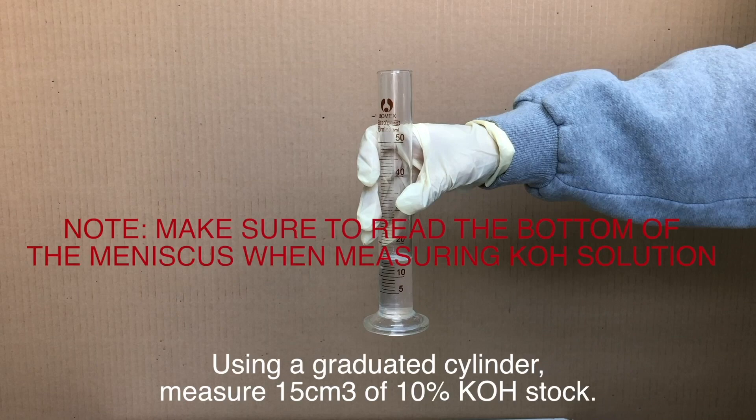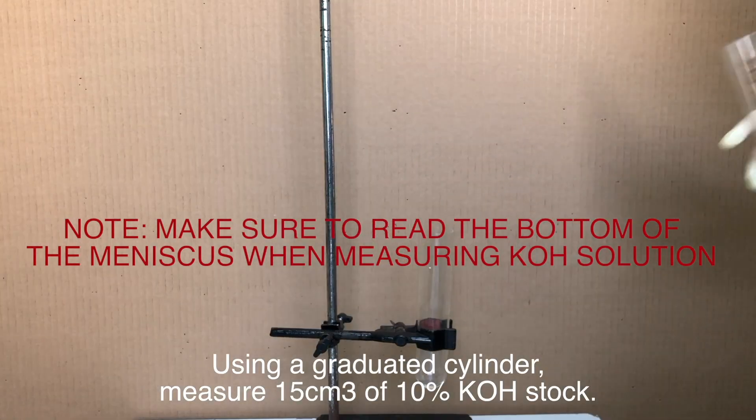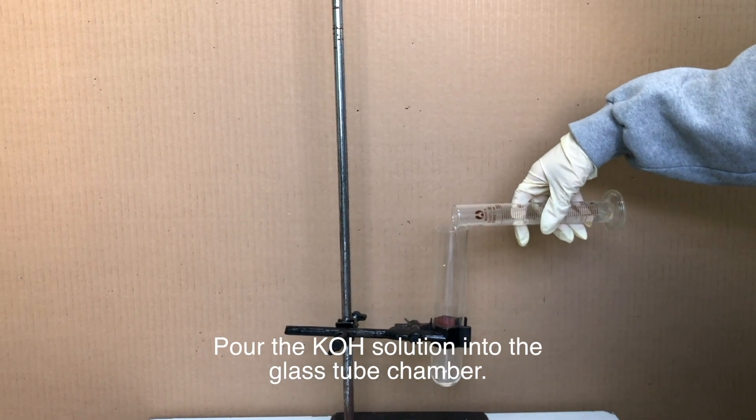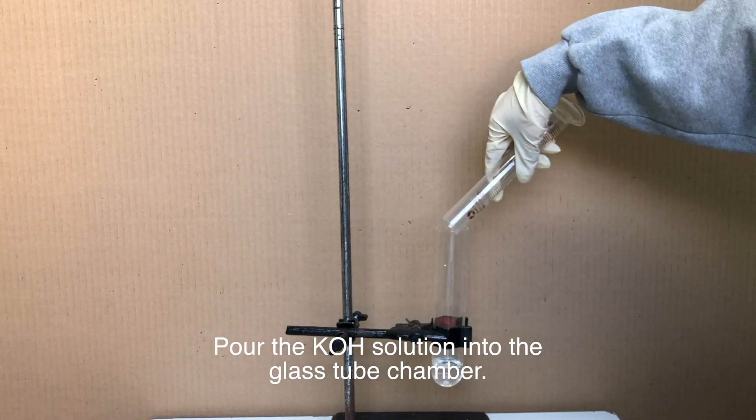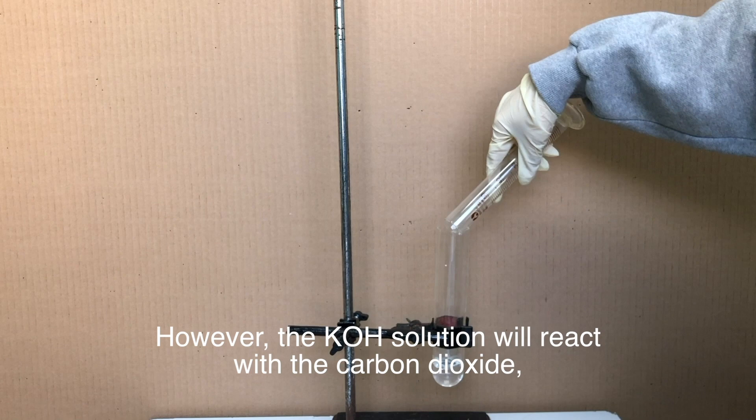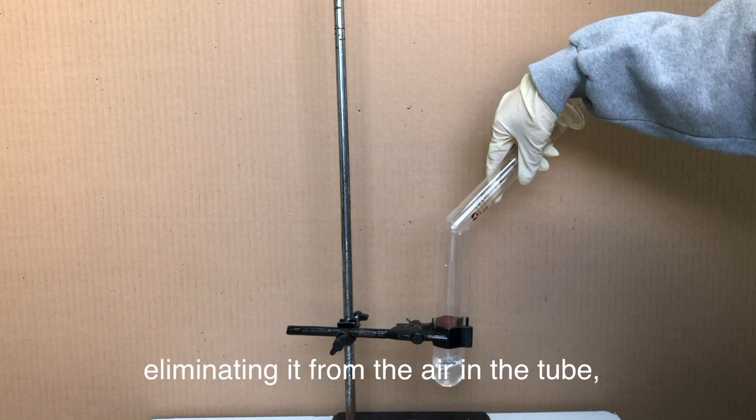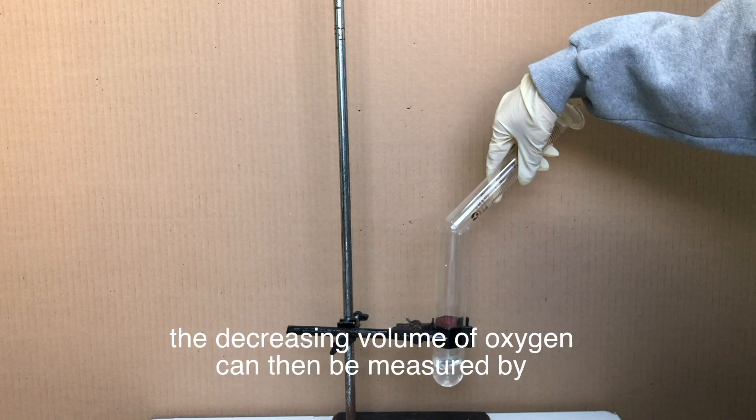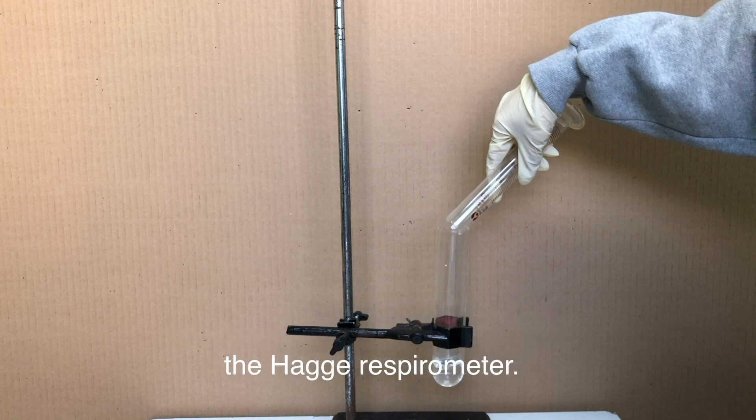Using a graduated cylinder, measure 15 centimeters cubed of 10% KOH stock. Pour the KOH solution into the glass tube chamber. As beans respire, they take in oxygen from the environment and release carbon dioxide. However, the KOH solution will react with the carbon dioxide, eliminating it from the air in the tube. The decreasing volume of oxygen can then be measured by the Hagi respirometer.